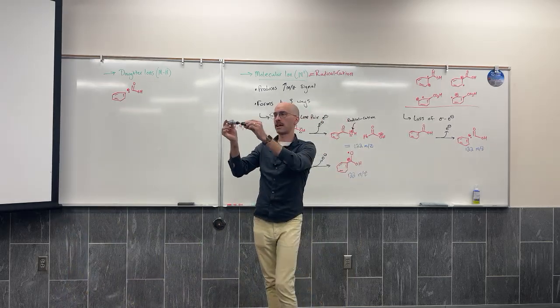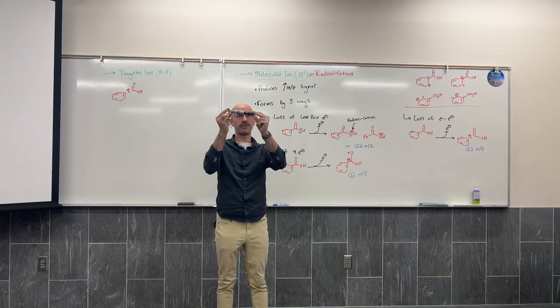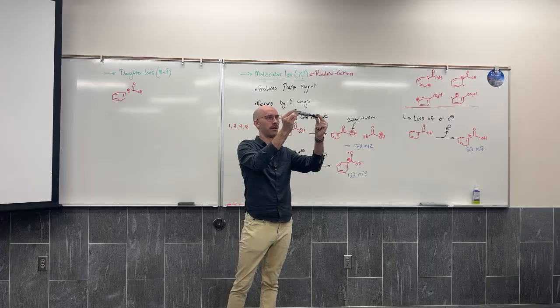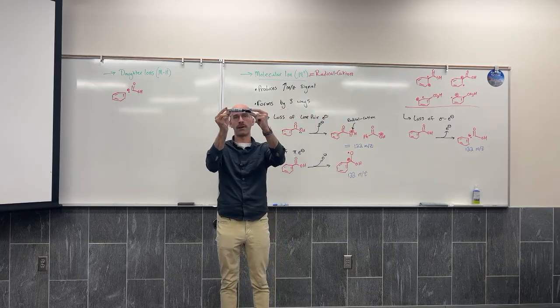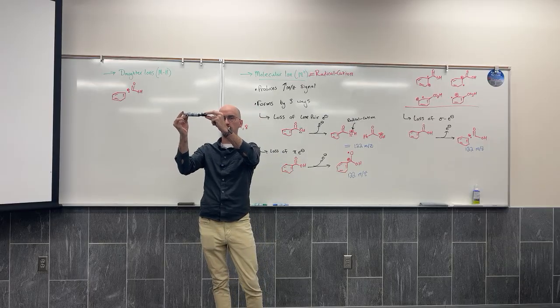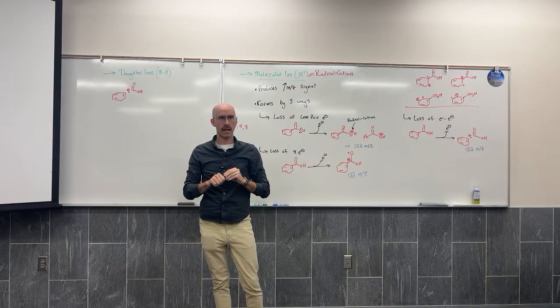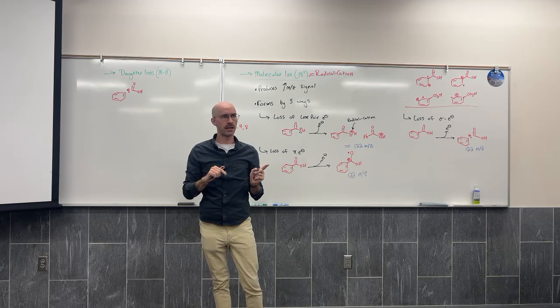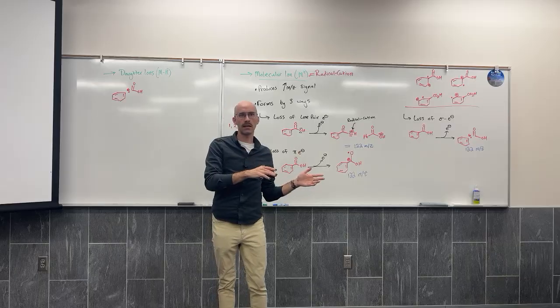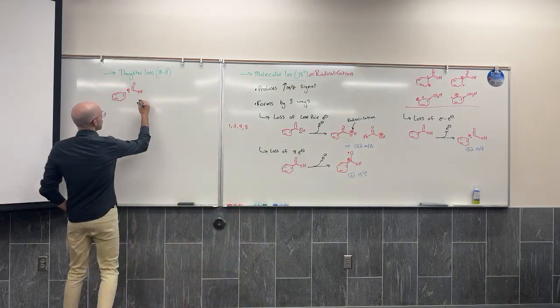This is like trying to get my marker to travel down the length of I-15 from Bountiful to Provo like this, just next to each other without actually being connected. The smallest amount of disruption, and they're going to separate. How will they separate? That electron has to go to one group or the other, and the positive charge then will be left in the wake with the other one. So 2 possibilities from here.